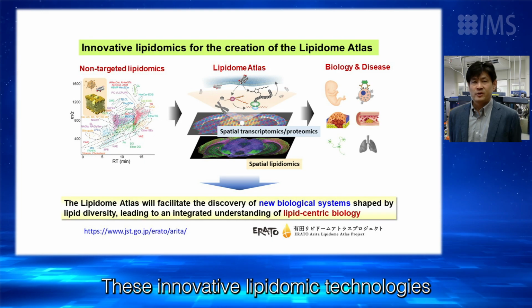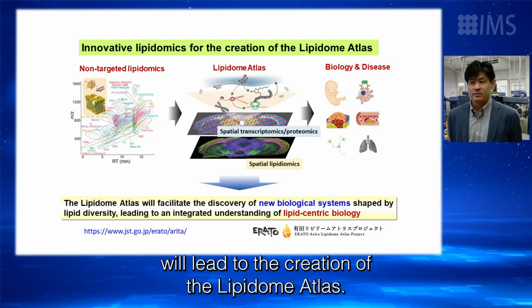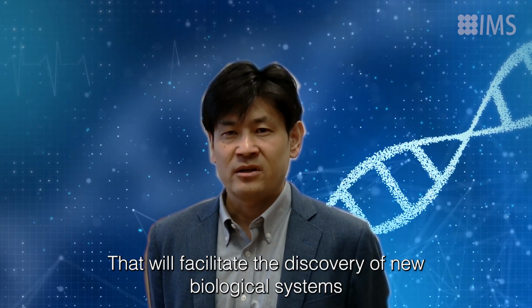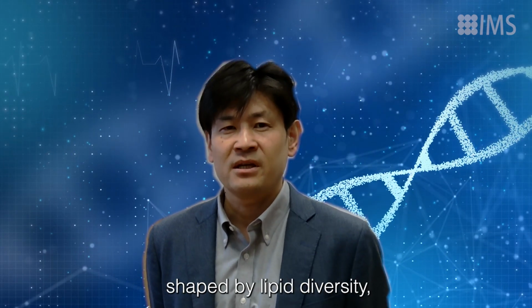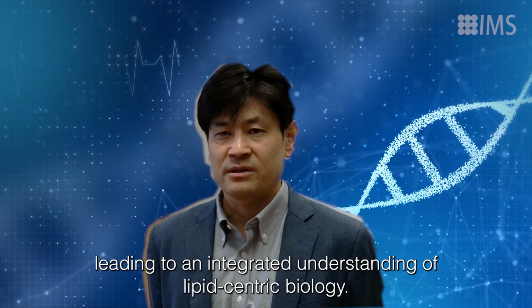This innovative lipidomics technology will lead to the creation of the lipidome atlas that will facilitate the discovery of new biological systems shaped by lipid diversity, leading to an integrated understanding of lipid-centric biology.